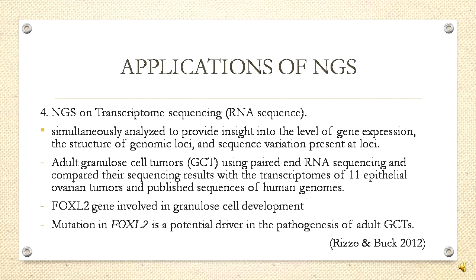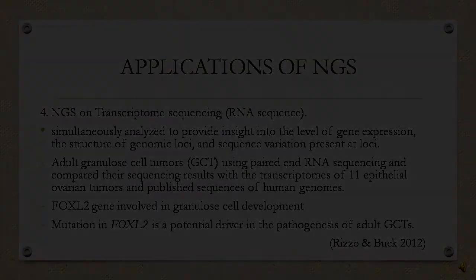On a side note, pair-end sequencing basically allows users to sequence both ends of the fragment and generate high-quality alignable sequence data, particularly to references, where this improves the quality of the entire set of sequence data. It also facilitates detection of genomic rearrangements and repetitive sequence elements, as well as gene fusions and novel transcripts.